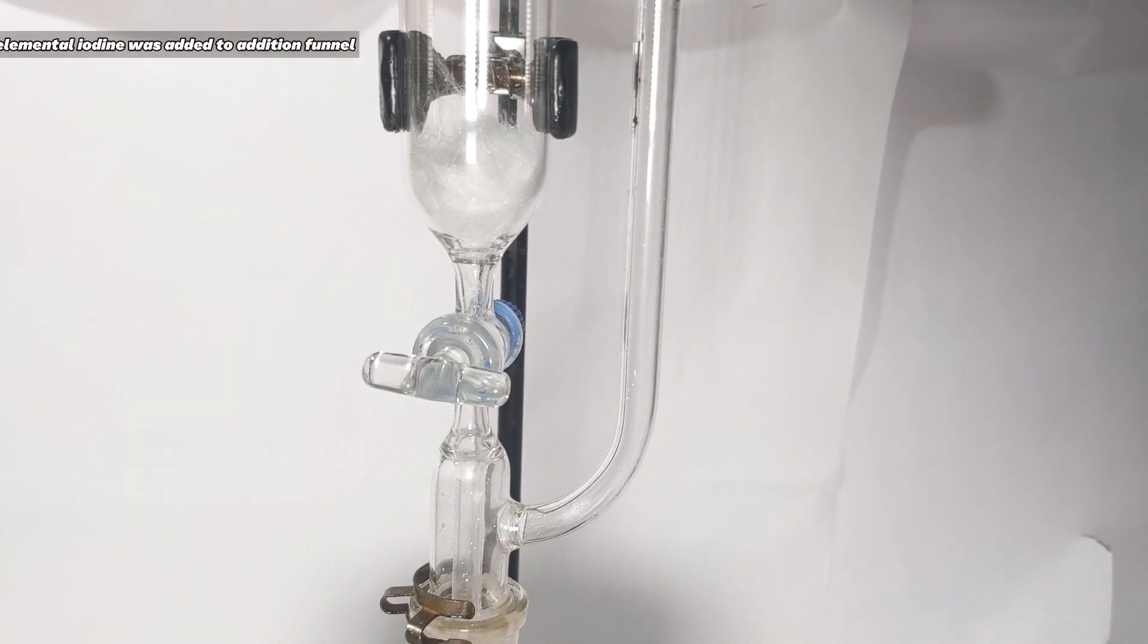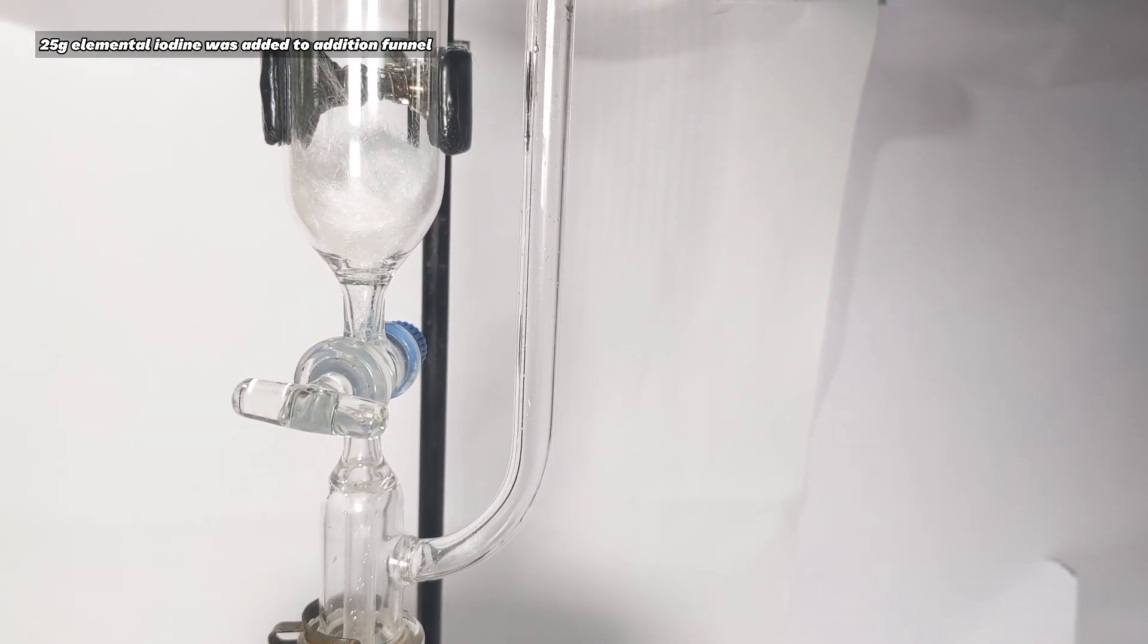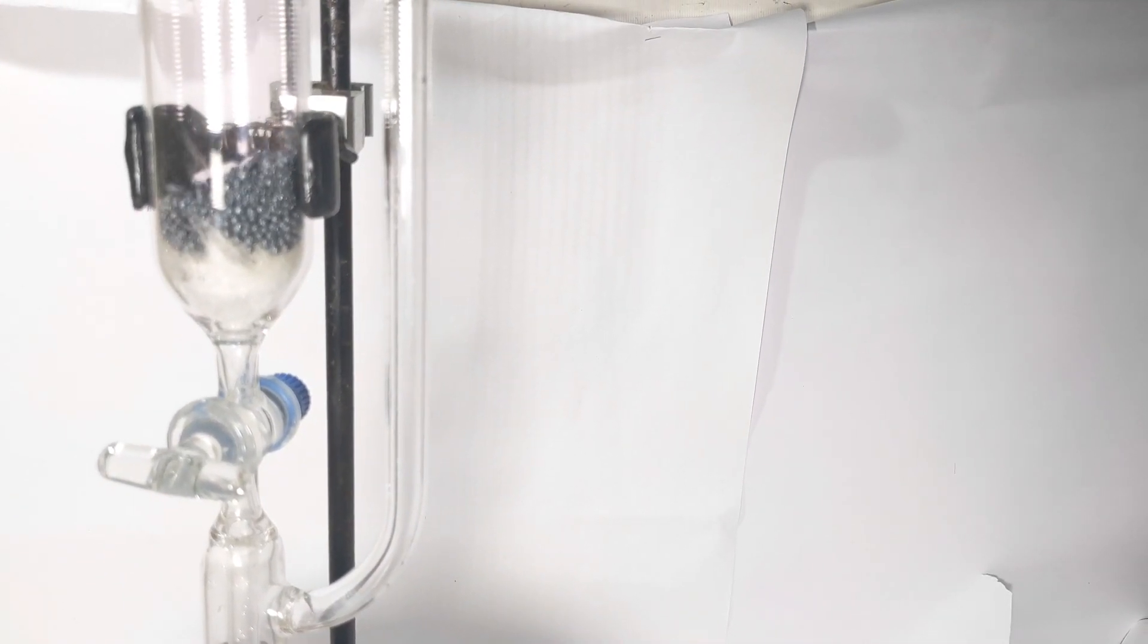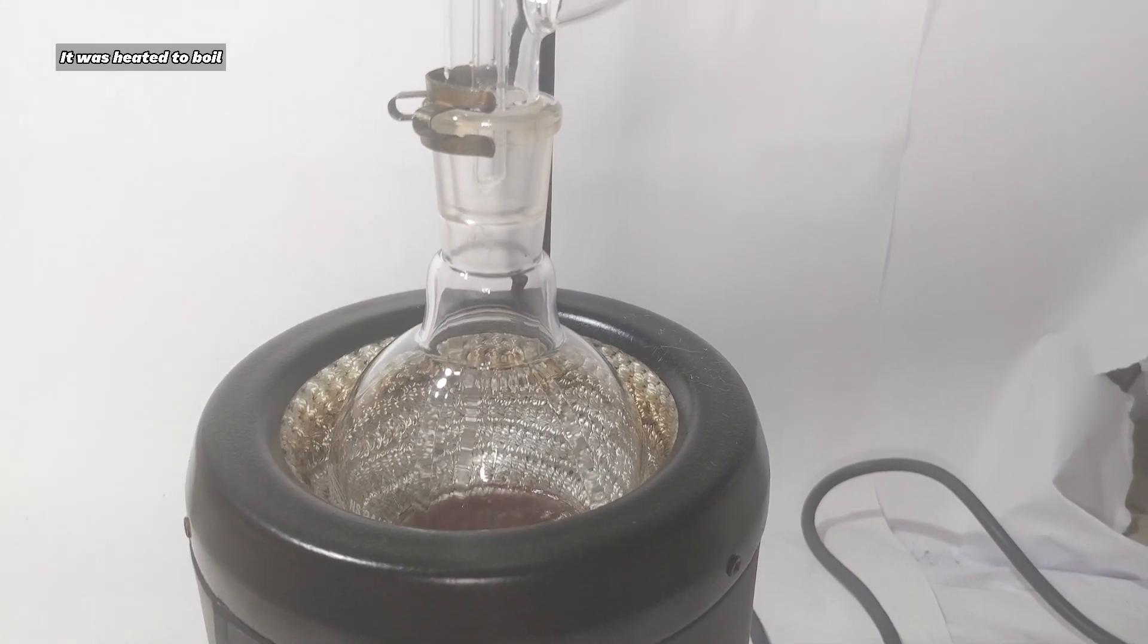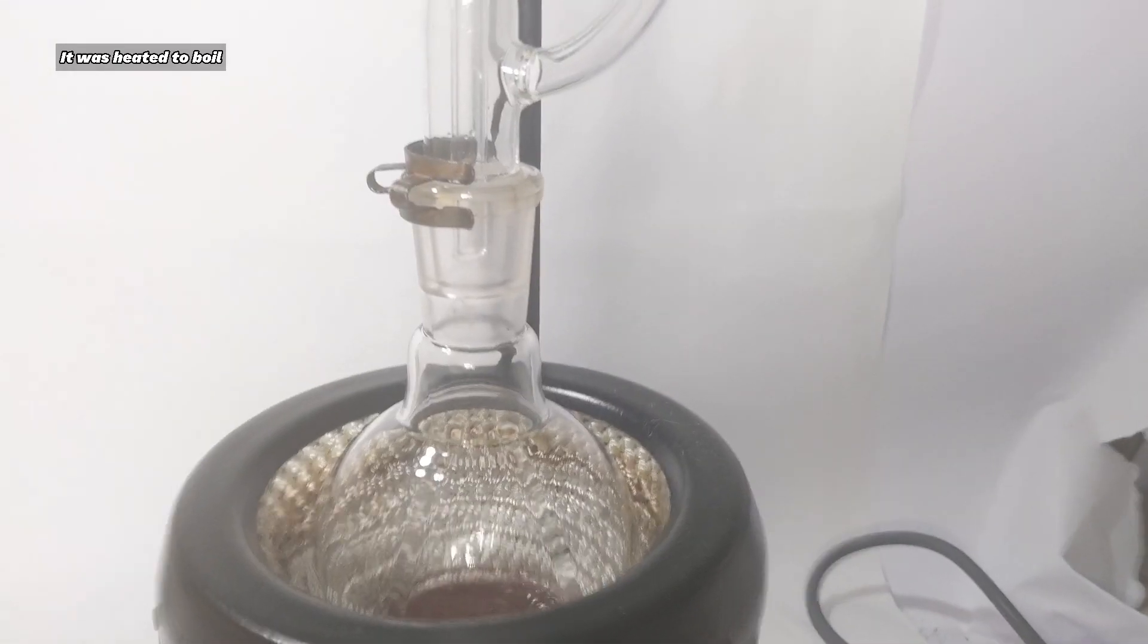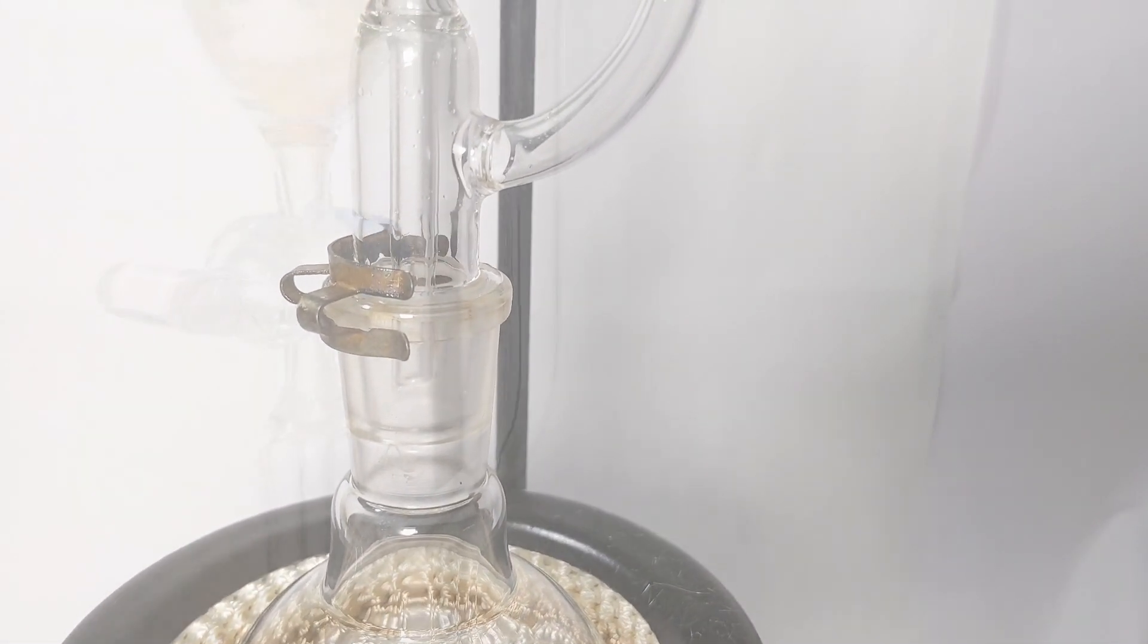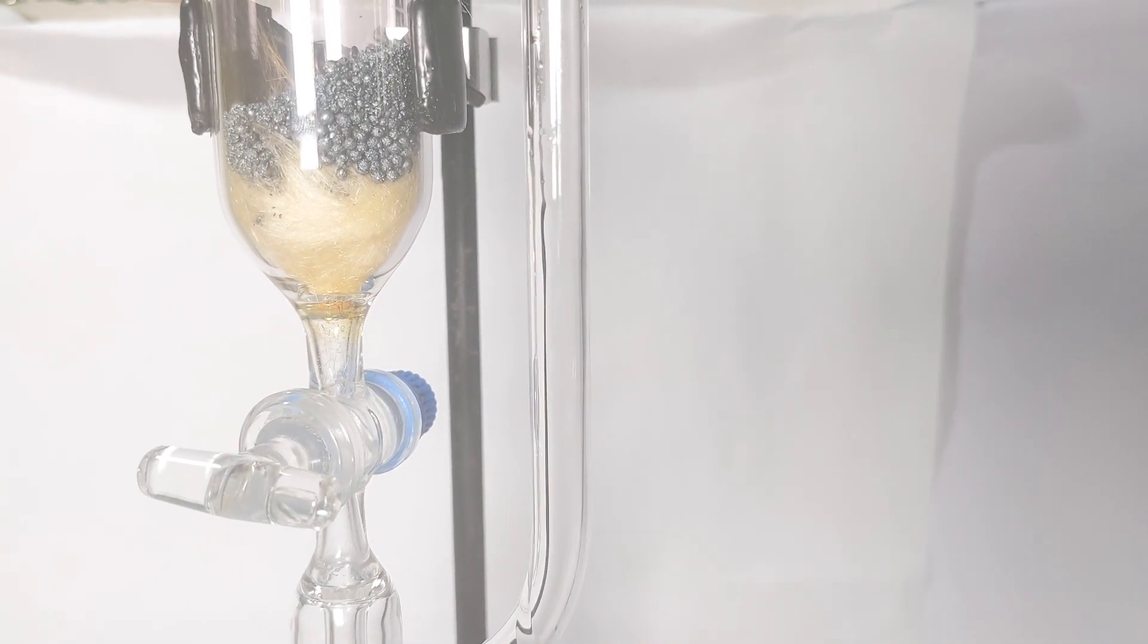The addition funnel was charged with 25 grams of elemental iodine in the form of crystals. The heating mantle was turned on and the solution was heated to boil. You can clearly see the vapor front climbing up the sides of the tube of the pressure equalizing addition funnel. It goes all the way up into the funnel.